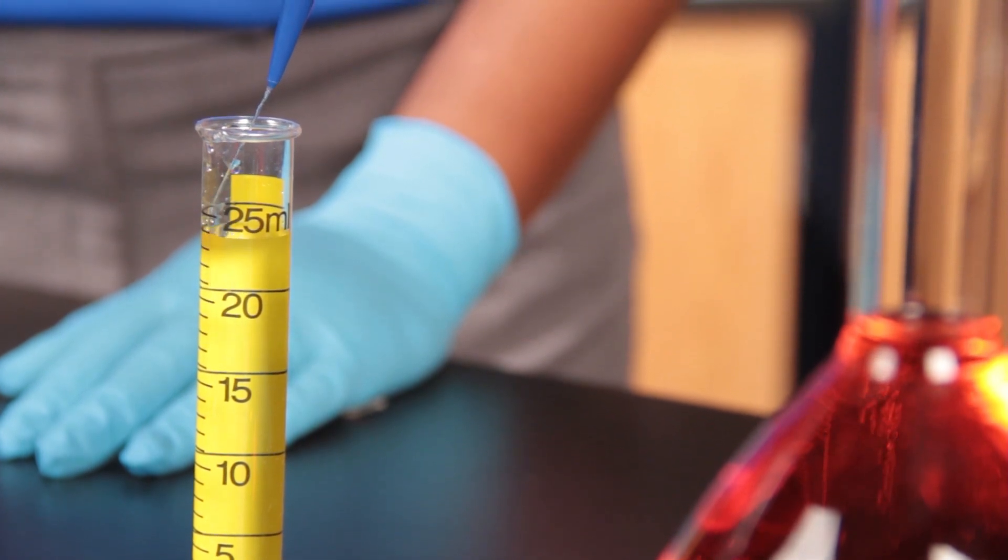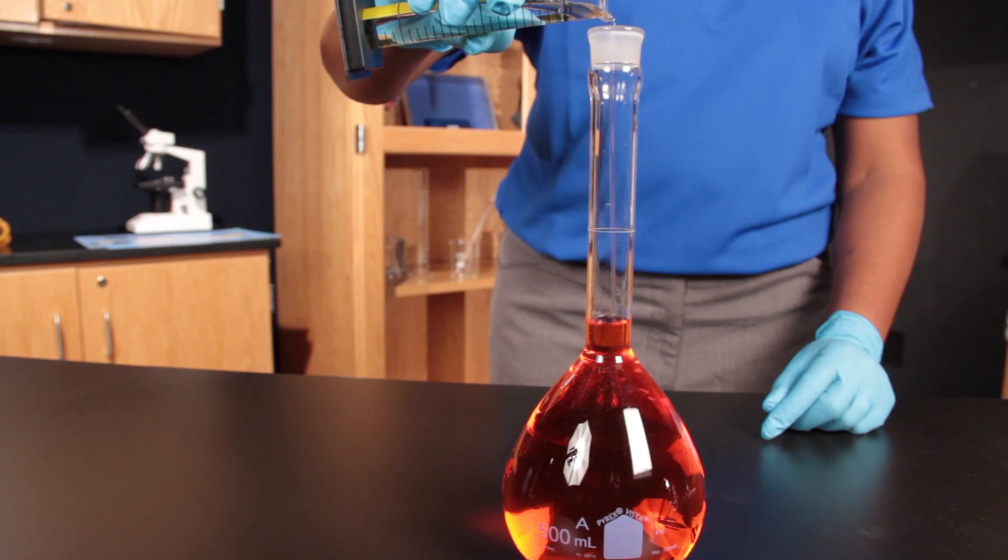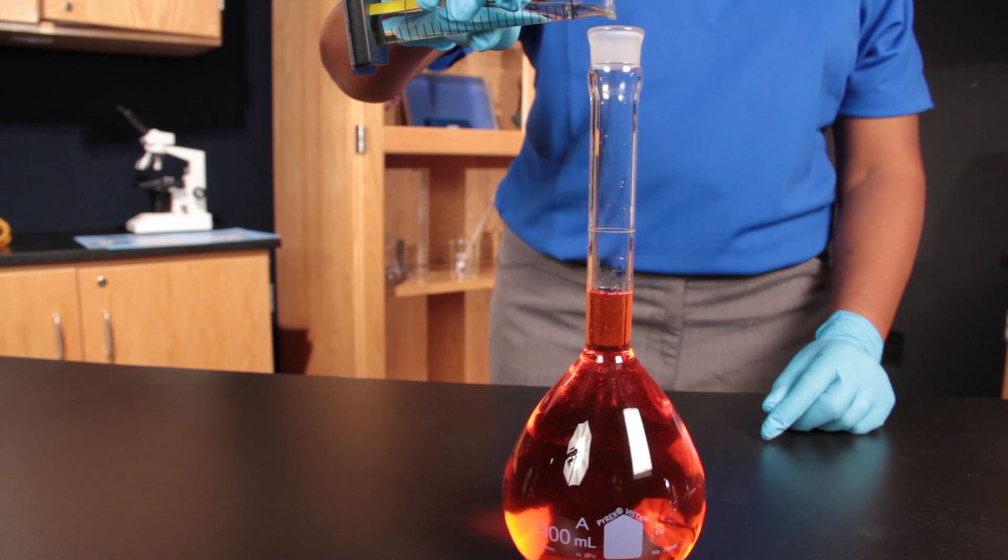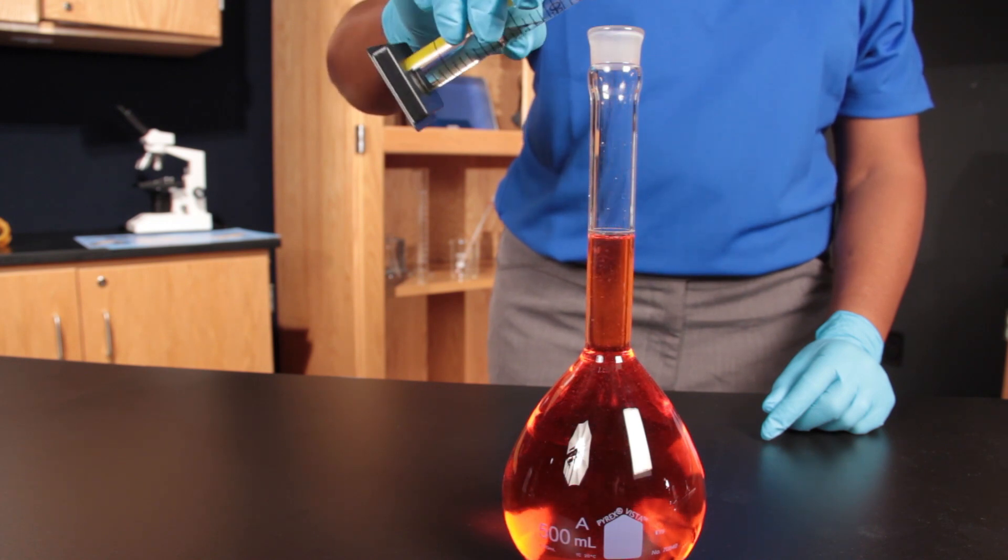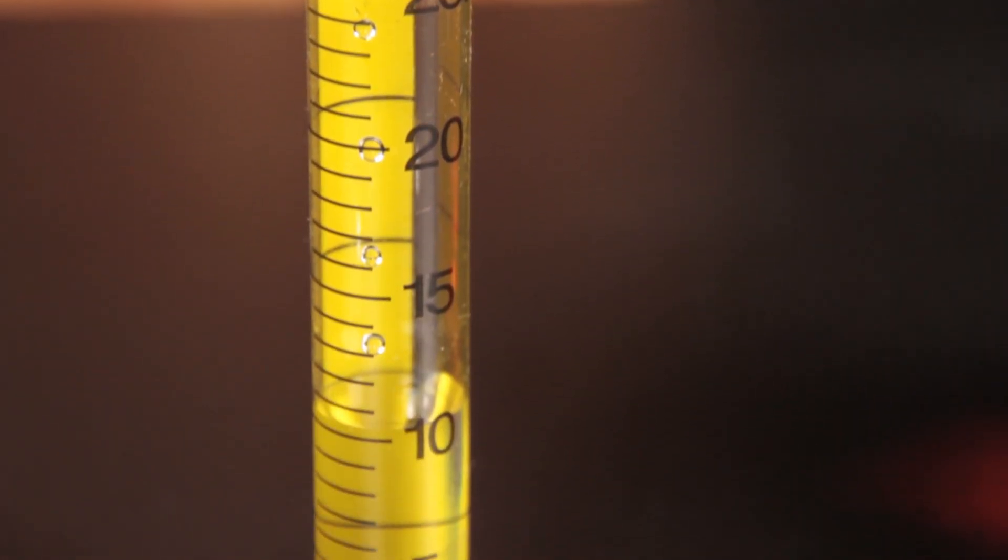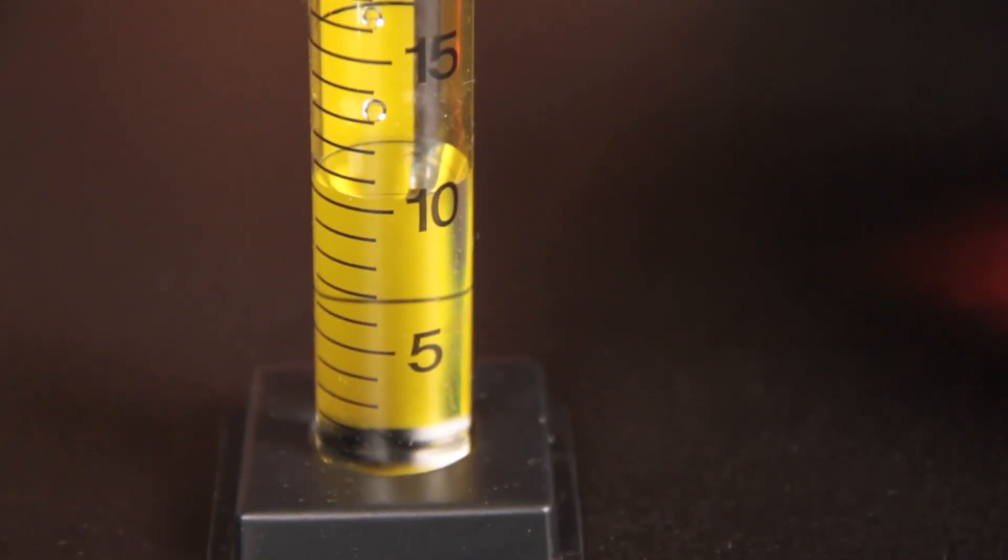Use a small graduated cylinder with water to find out how much volume has been lost. Note the level of water in the graduated cylinder before and after adding it to the volumetric flask to calculate this amount.